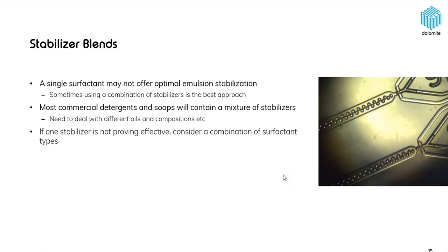In the case of microfluidics applications, it's a little less common that you would have unpredictable compositions of your droplets, but at the same time, even for a known composition, you might still find that having more than one approach to stabilizing that interface is effective.